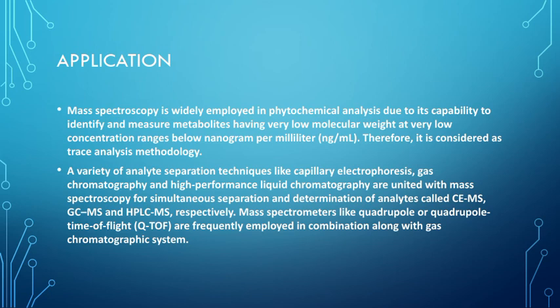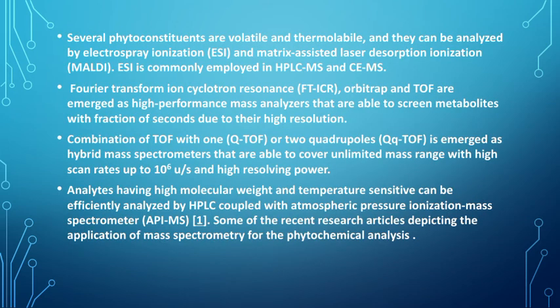Mass spectrometers like quadrupole or quadrupole time of flight are frequently employed along with gas chromatography systems. Several phytoconstituents are volatile and thermolabile.